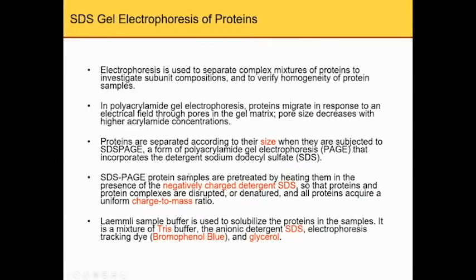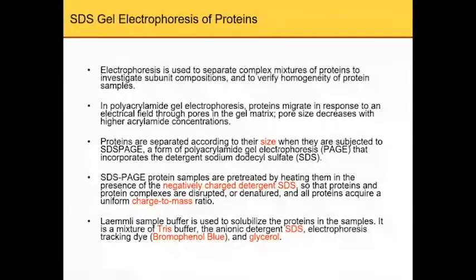So basically we want the protein to be separated based on their size in the SDS-PAGE gel.